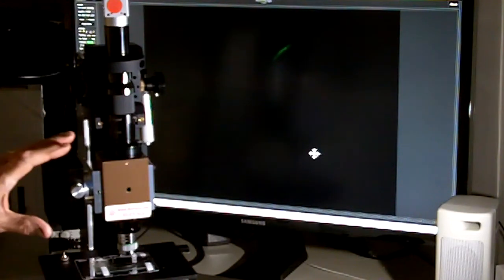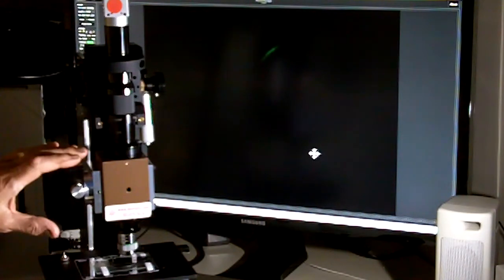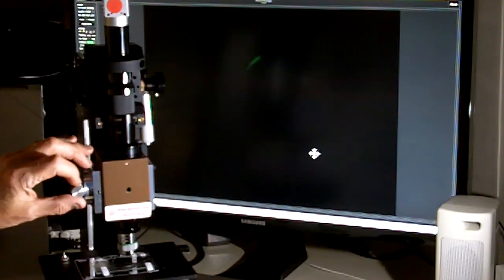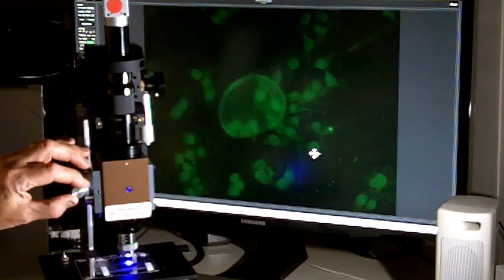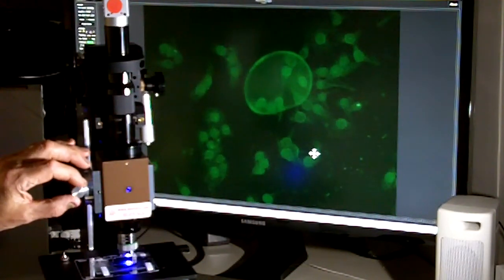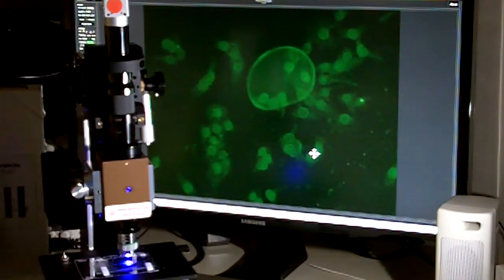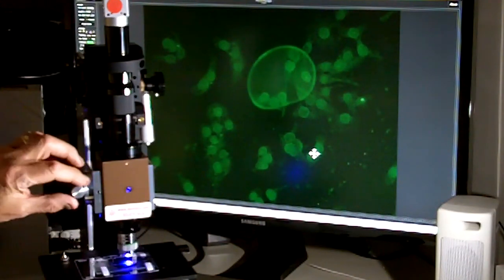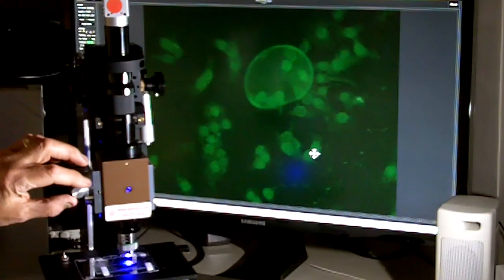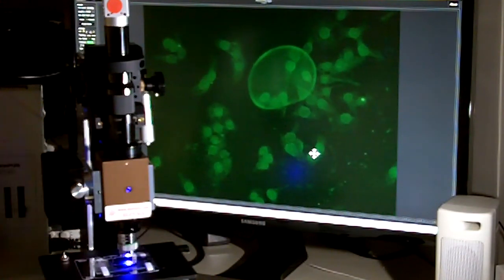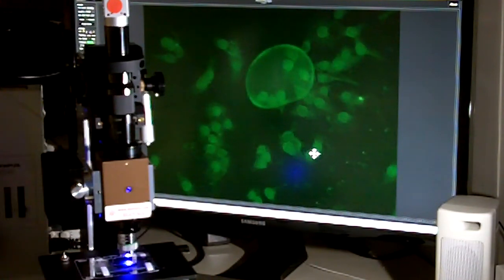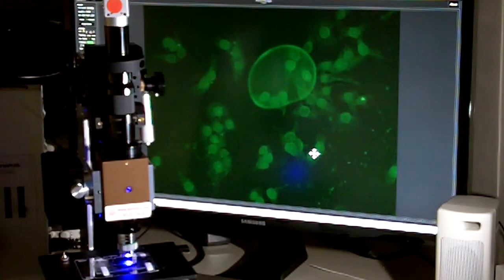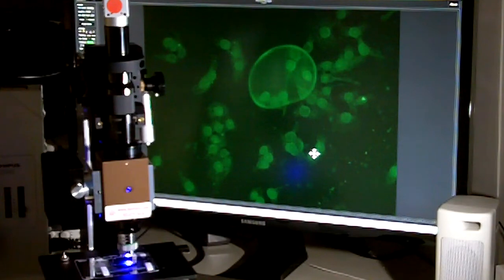To add to the U.S. flavor of this version of the MHS, we have a USA-made LED. And in this case, we're exciting a very old slide that I've got here of some cultured cells for an ANA test. It's a slide about 20-some years old, and it still does a bit of fluorescing with FITC. And this slide was probably prepared before they even had GFP on the market.